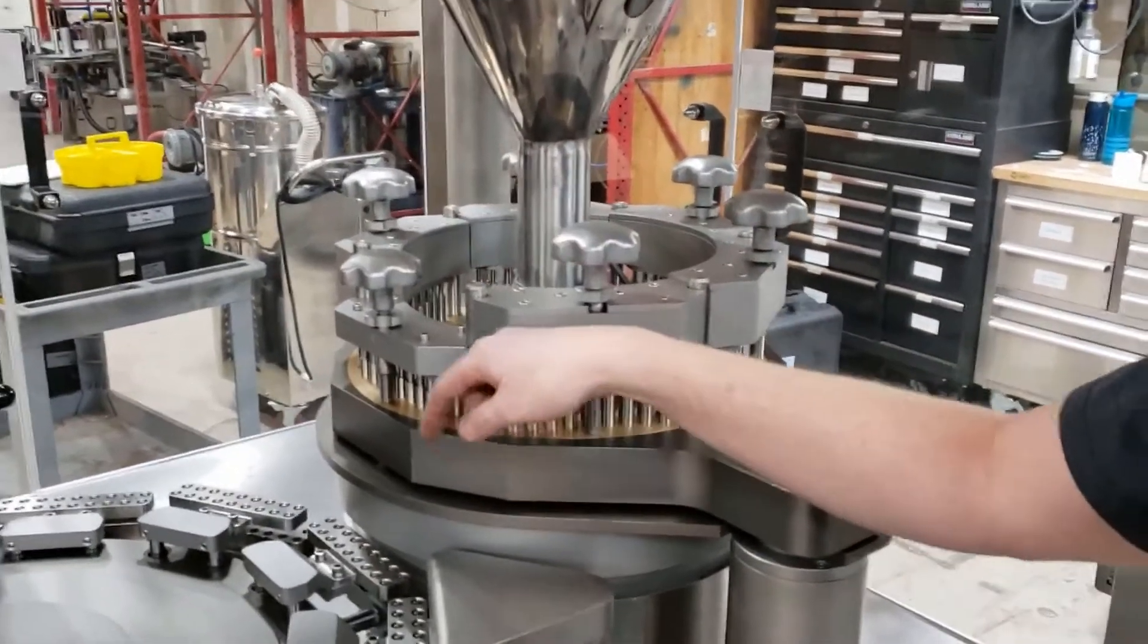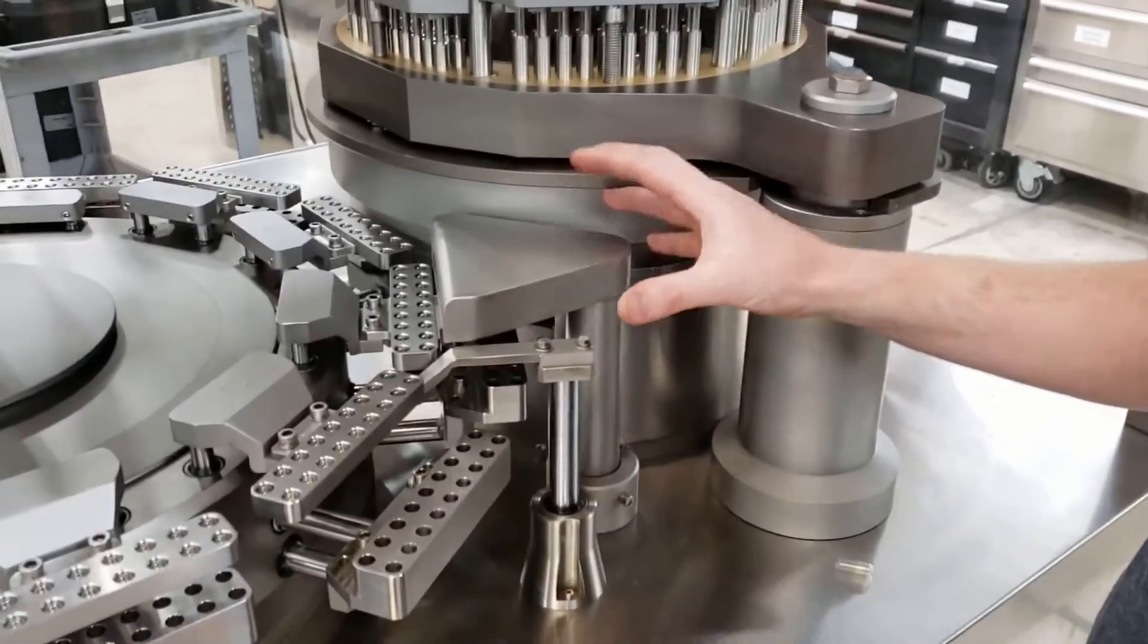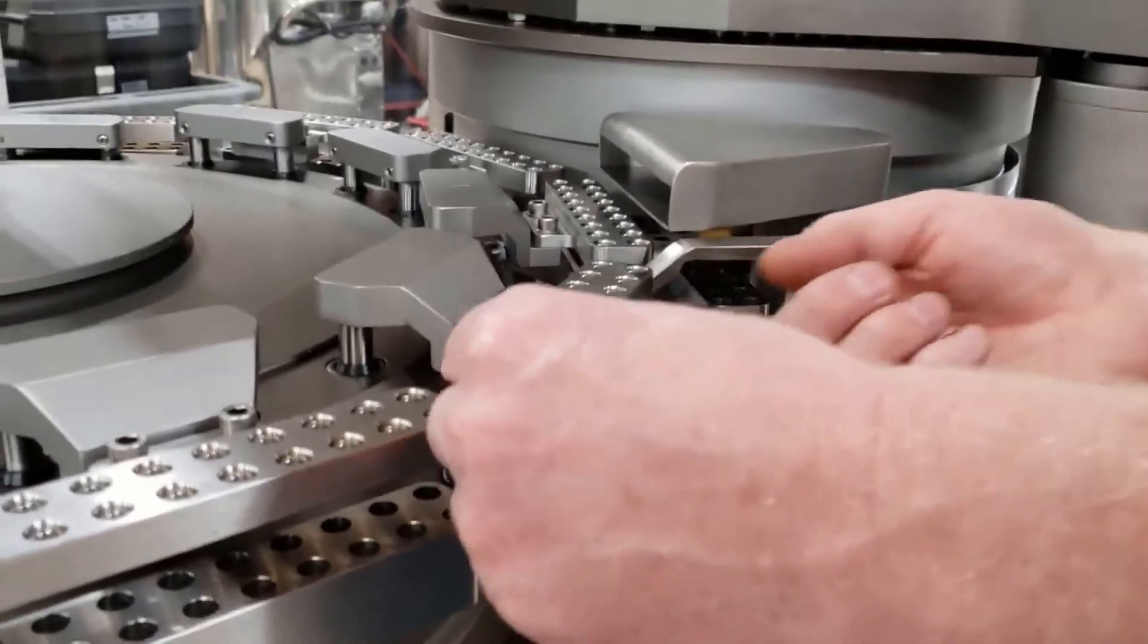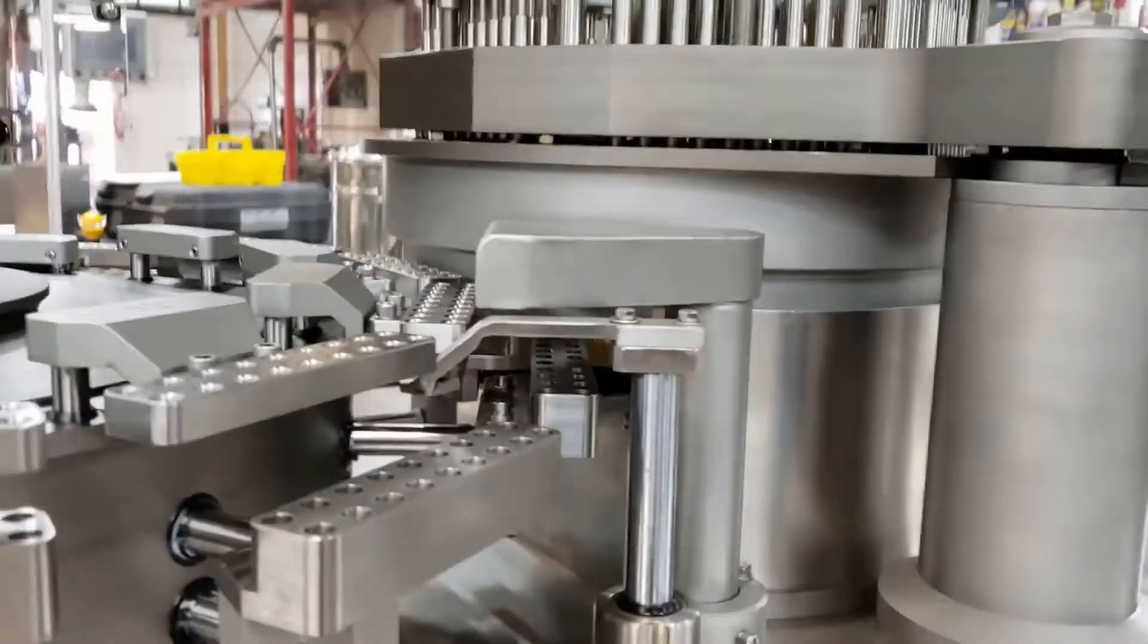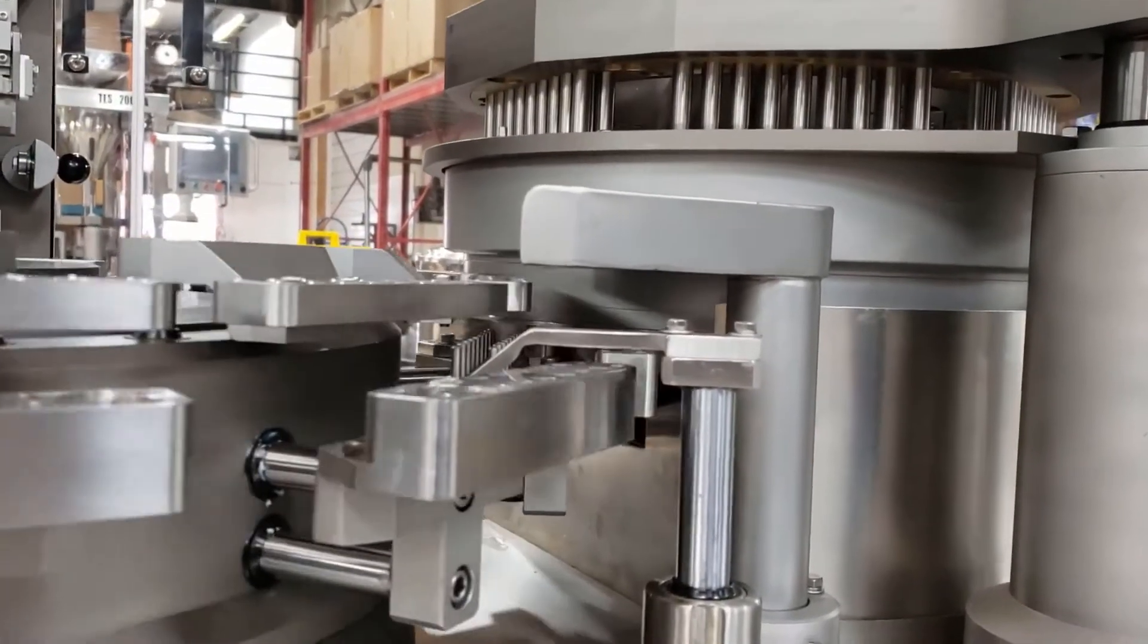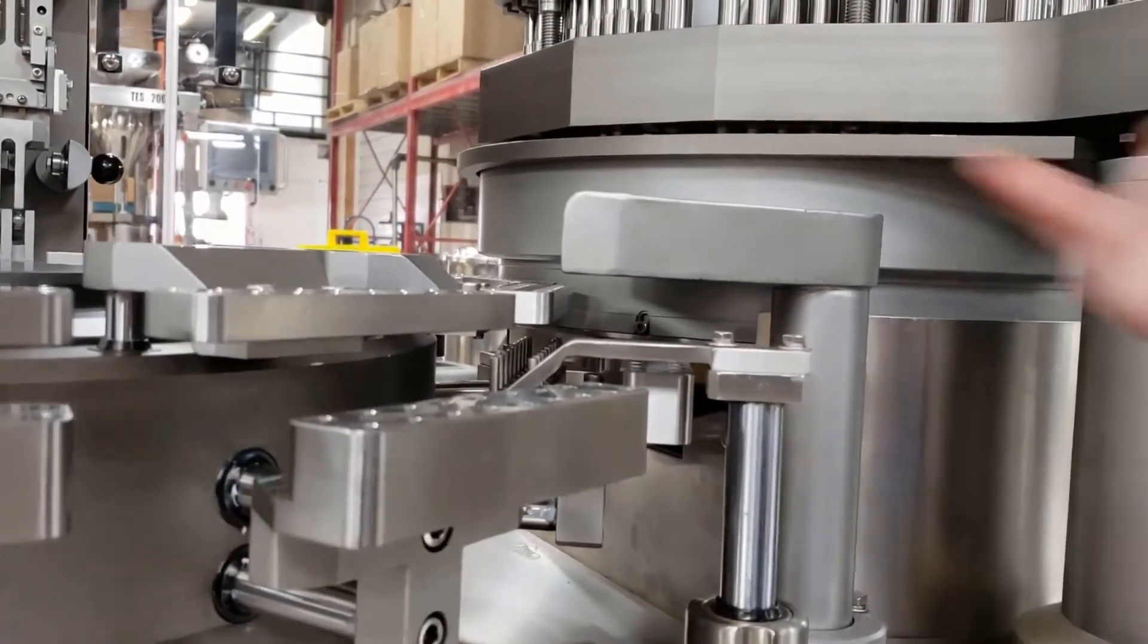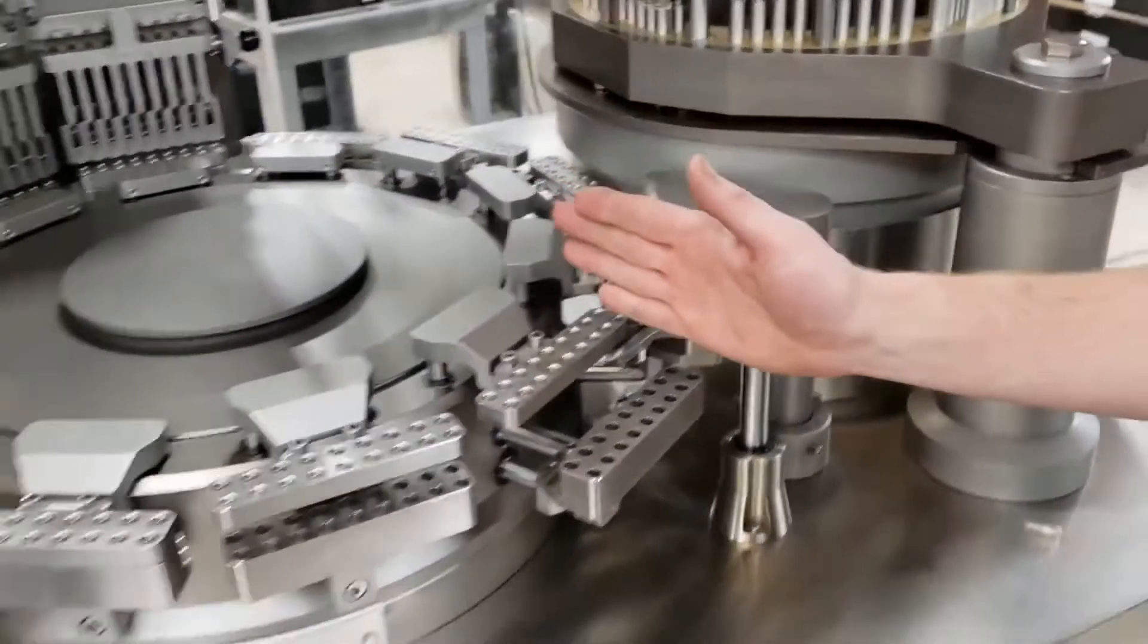But as our capsules get filled, transferred into our segment, now we're going to go on to our next station, which is our faulty capsule station. So this is checking to see if a capsule is still hanging down, it didn't separate. These pins, as we watch as I jog it around, they're going to come down and see if there's a capsule attached. There's no capsule attached, it's not going to push it out. If the capsule was attached, these pins would come up and push it out, and then it would get sucked away.